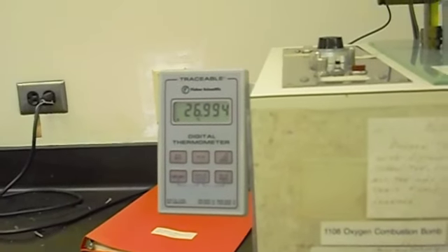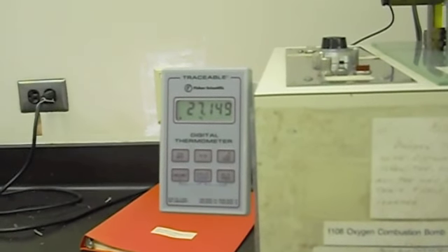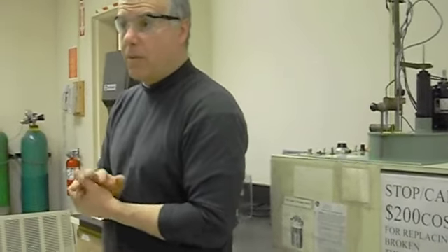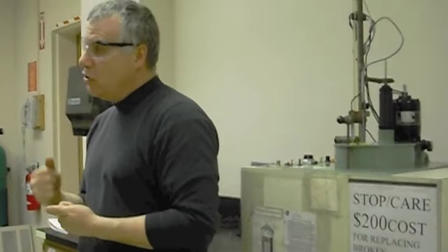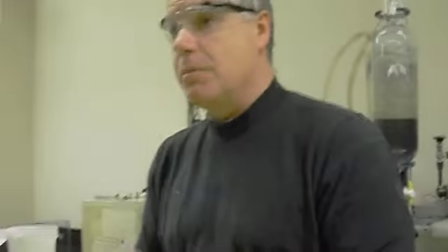So, when you do this experiment, there's really an easy way and a difficult way to get through the data analysis. The difficult way is to go through a full differential error propagation based on assumed uncertainties in things like the water volume and the masses of everything and the temperatures, et cetera. And that's perfectly valid, but I think it's actually inferior to an approach which we can make, which is simply to make replicate runs.